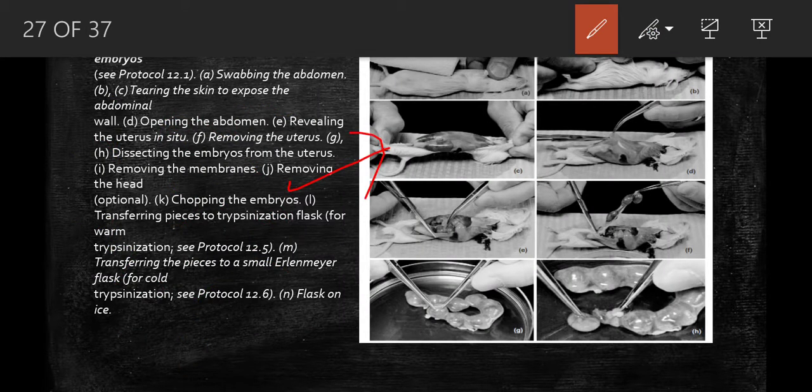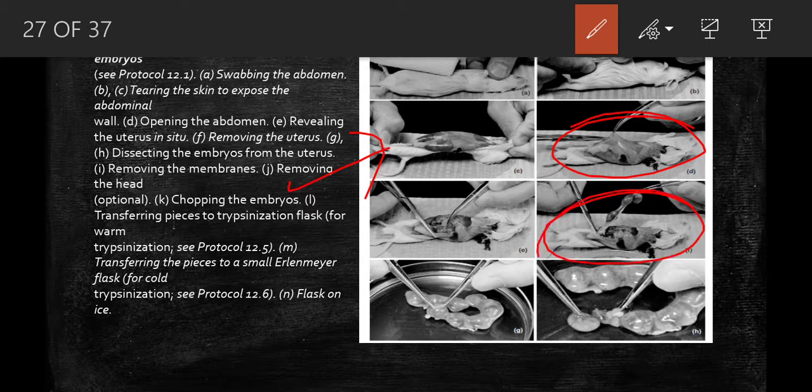After that, cut longitudinally along the median line and expose the abdomen with sterile scissors, revealing the viscera. At this stage you can see the uterus filled with embryos in the posterior abdominal cavity. Dissect and take out the uterus, then place it in a 25 to 50 ml screw-capped vial.